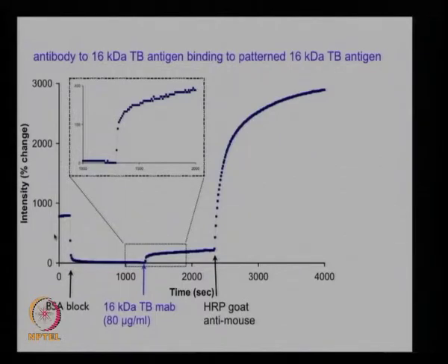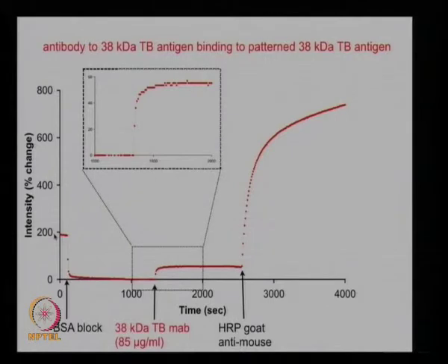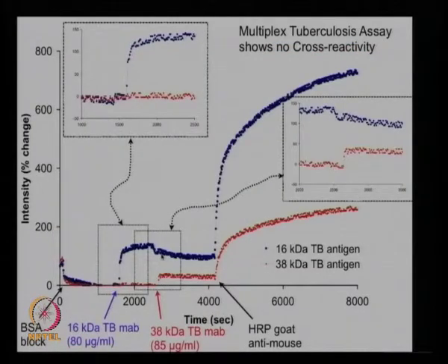Yes, so if you're trying to create a diagnostic, just say yes or no. Here I can see yes or no. Right, so that's one of the spots. Now, if you look at the second spot, which is filled with a 38 kilodalton TB antigen, you can do the same experiment, and then we'll put them together. Right, there's two spots together.